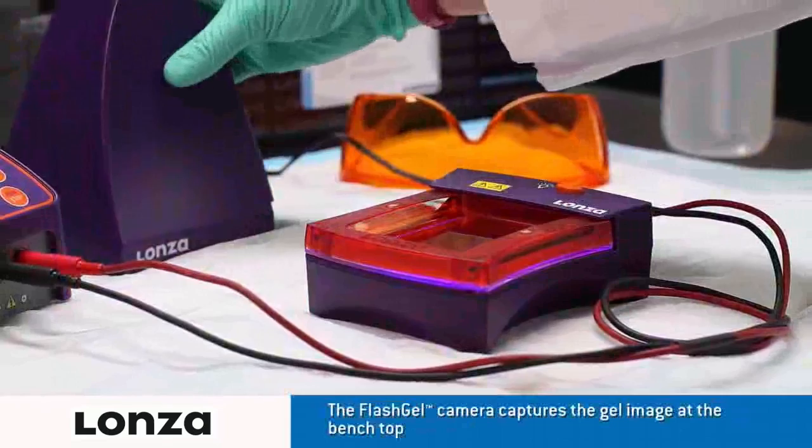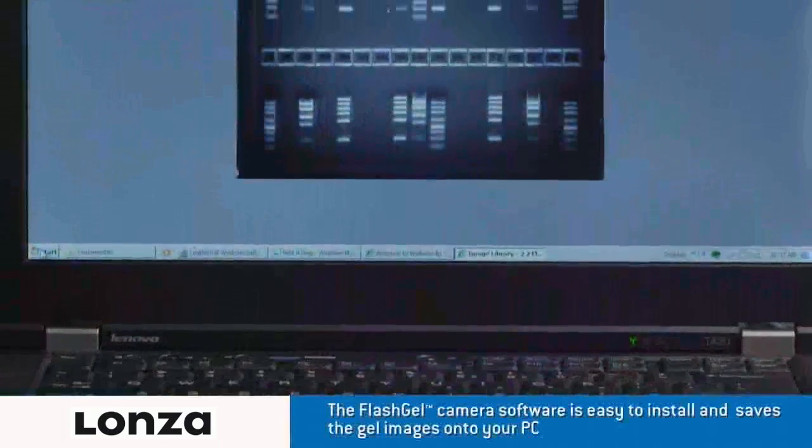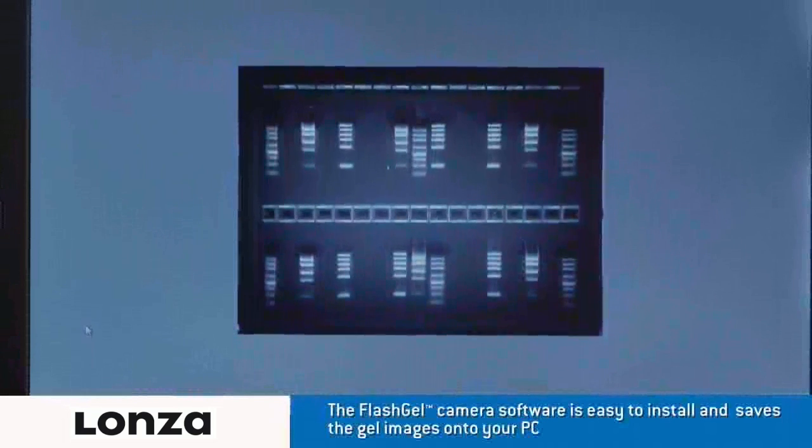After separation is completed, place the FlashGel camera gently onto the dock. The FlashGel software must be uploaded to your PC before capturing the image.